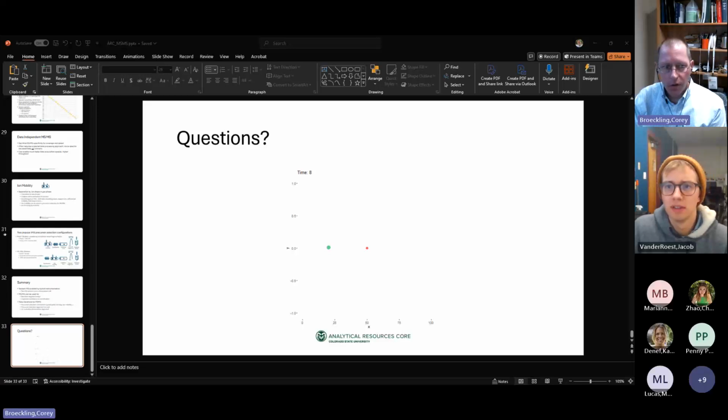It's a very good question. So the MSMS libraries, depending on which one you're searching, the example that I showed in the screenshot was from the NIST, the National Institute of Standards and Technology MSMS library. And when they build their library, they actually generate the library with many collision energies. So they might collect collision energies at 5, 8, 11, 14, 17, 20, 23. So very fine increments so that it's very likely that any spectrum that you generate is actually going to be represented very well in the library.